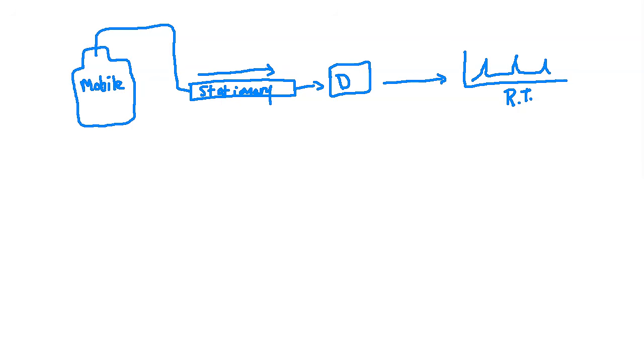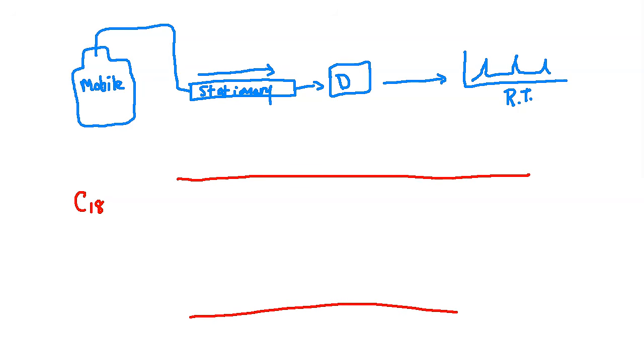All right, but for example, if we were to talk about using a C18 column, I'm drawing the inside of the column here. Okay, so imagine that this is the inside of the column. What you would find is a silica binding portion that sort of lines the bed of the column.